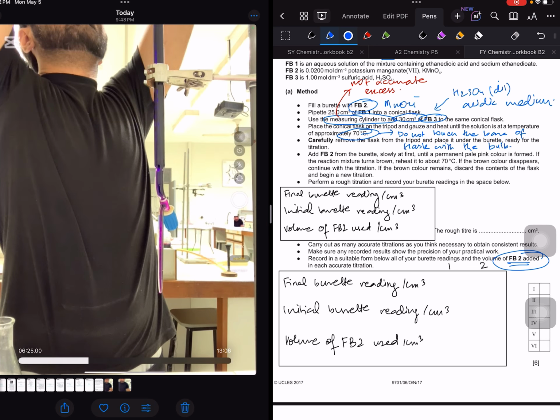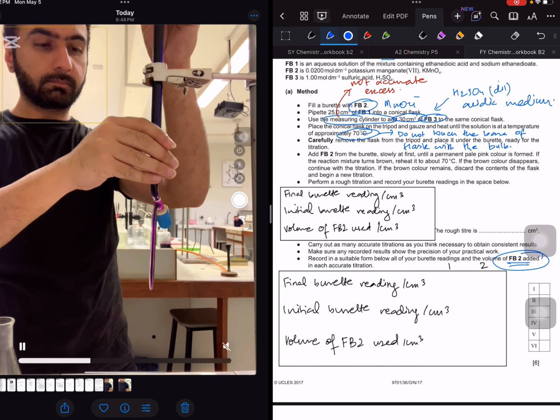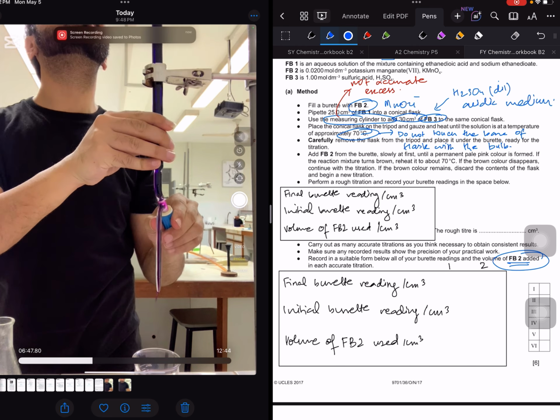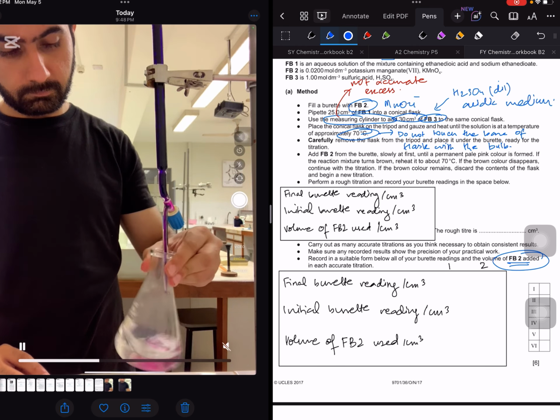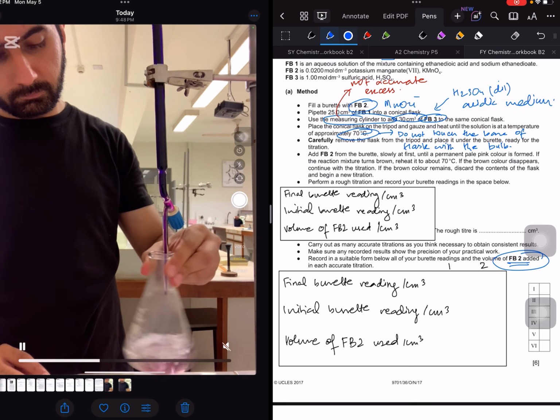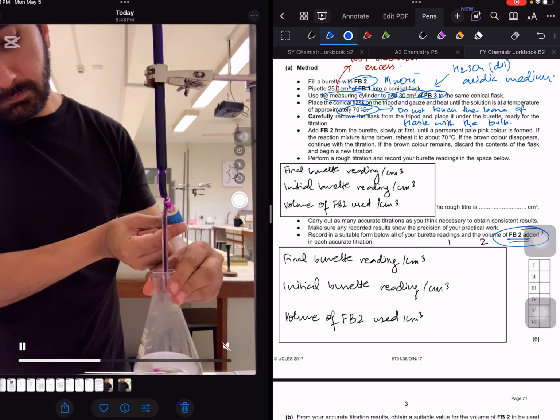Yeah, so I am now actually doing my perfect titration. Now my titration is ready. I'm going a little more ahead. Yeah, now I'm doing this titration. You can see the color is going away. It's decolorized, which means that the substance is getting reduced. Let me remind you of the fact.